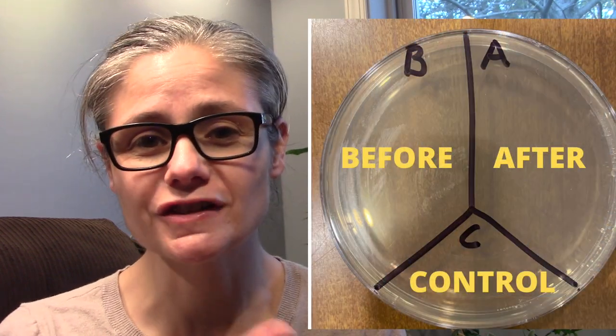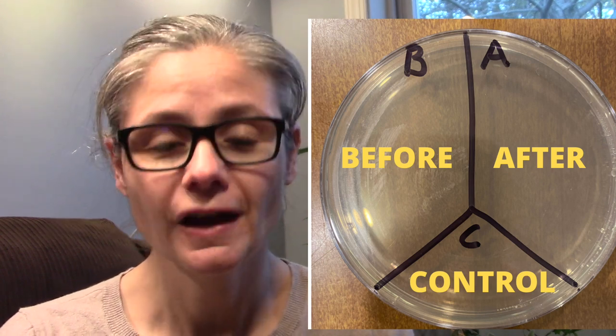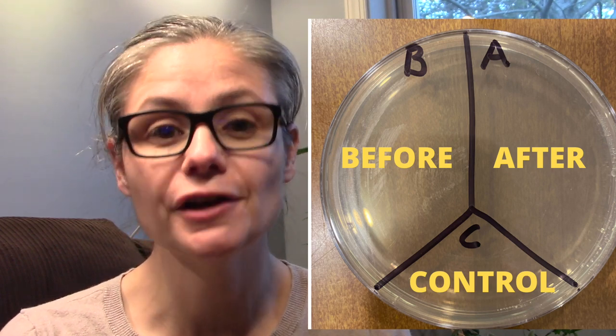I'm actually really interested in testing out Comet because I know my mom used it a lot when I was growing up. What I'm going to do to test the efficacy of the disinfecting power of Comet is take a petri dish just like this one and label it A, B, and C. I'm going to take some sterile swabs and swab areas of my toilet bowl and place that on B for before.